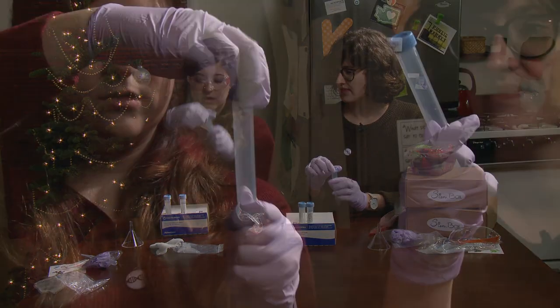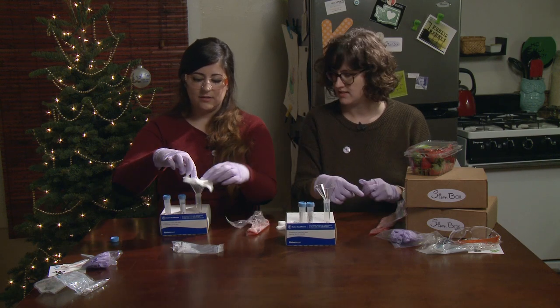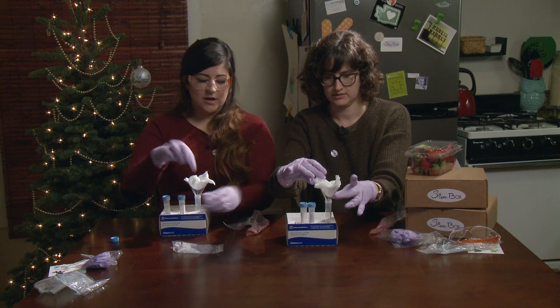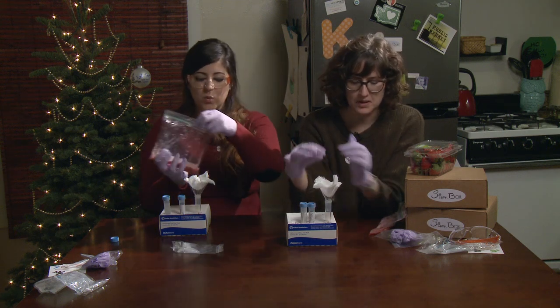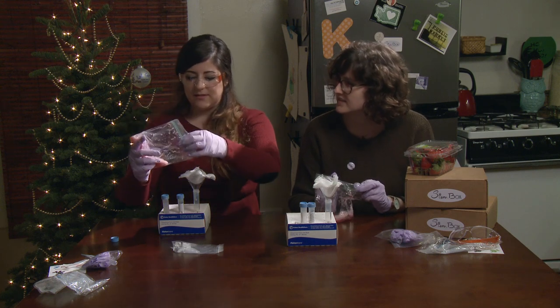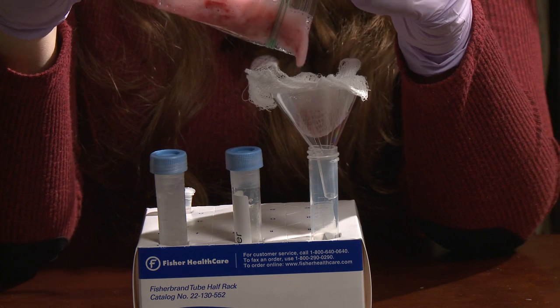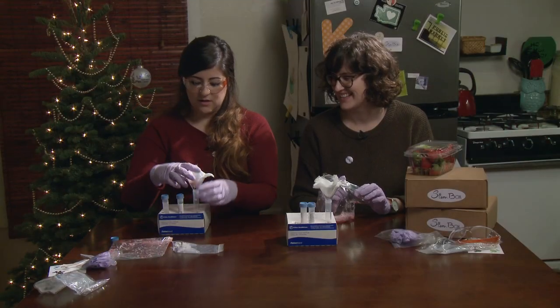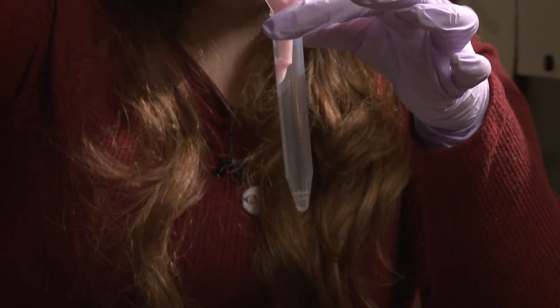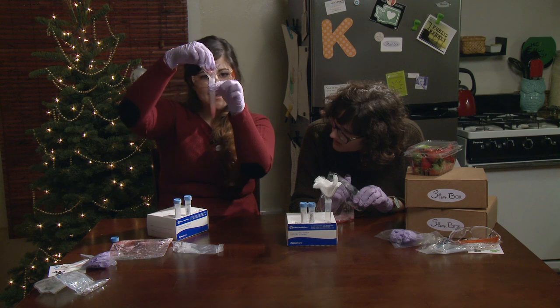Now we need our empty 15 mil conical tube — open it up. Now we need our funnel. Set the funnel on the inside. Take some of your gauze and pack it in — so it should look like that. I recommend pulling out as much liquid as you can to the bottom by squeegeeing with your fingers, then squeezing it through the gauze into the tube. About that much liquid is good.